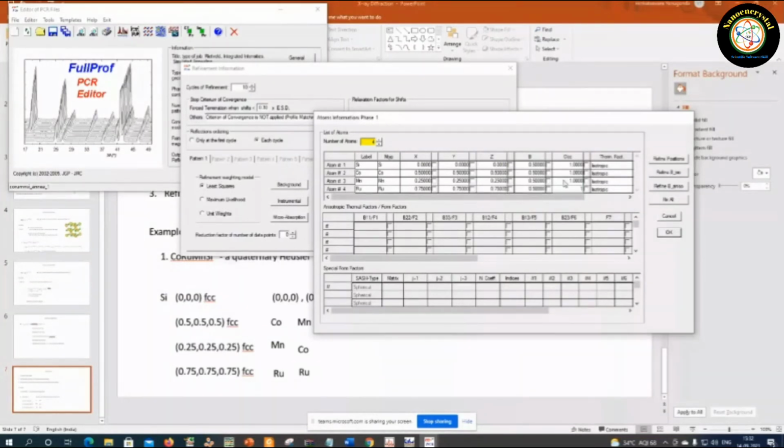So there is a term called isotropic, meaning in XYZ directions the atom is vibrating isotropically. And sometimes you may need to refine with anisotropic, then this will be disabled and you will get different directions. You will be having different terms. Right now I'm assuming isotropic. What we are focused on now is whether this structure will match or not. So that is our task.